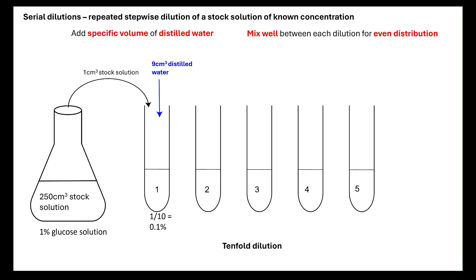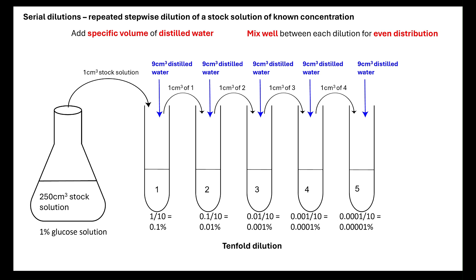I'm going to repeat this, but before I repeat it, I'm going to mix well between each dilution for even distribution. Every time I'm going to add 1 centimeter cubed and 9 centimeter cubed of distilled water. With each time, what I am doing is a 10-fold dilution. I'm taking my 1% glucose solution and doing a 10-fold dilution. I've gone from 1 to 0.1 to 0.01 to 0.001. I'm going to keep doing that until I've got the known concentrations that I would like. That's how we do a serial dilution: repeating these steps each time, adding a specific volume of distilled water to stock solution so that we can get known concentrations.